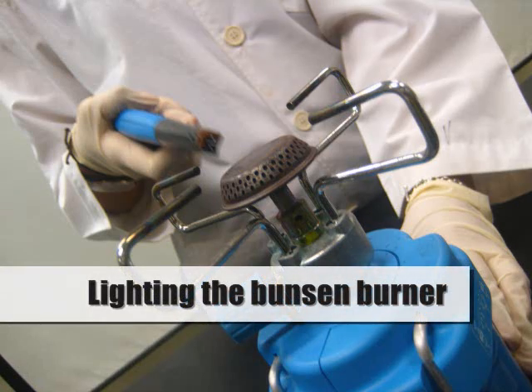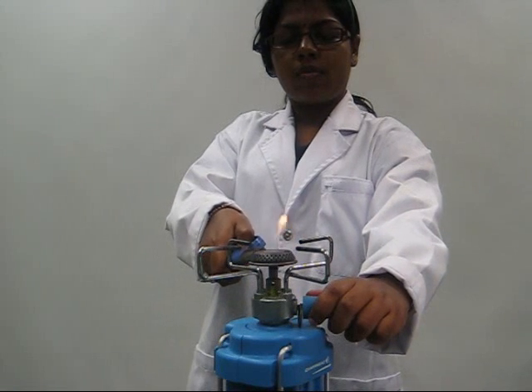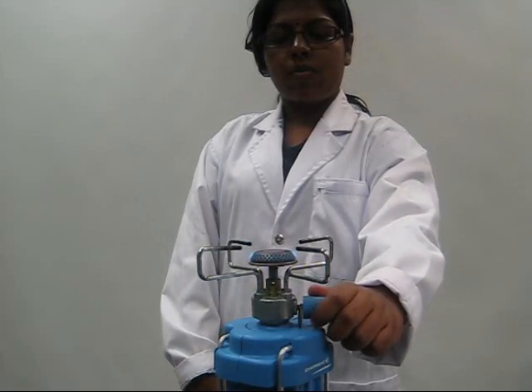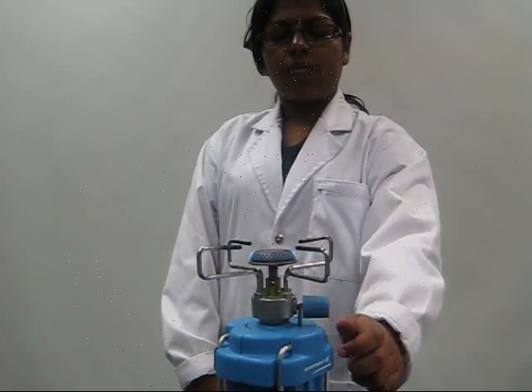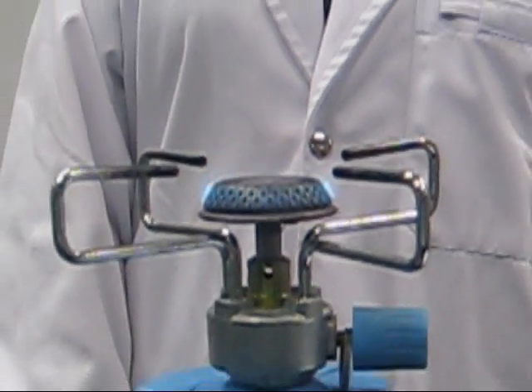Lighting the Bunsen burner: ensure that you follow the safety precautions when lighting the Bunsen burner. Do not turn on the flame when the beaker is on the Bunsen burner. Use a non-luminous flame for steady heating.